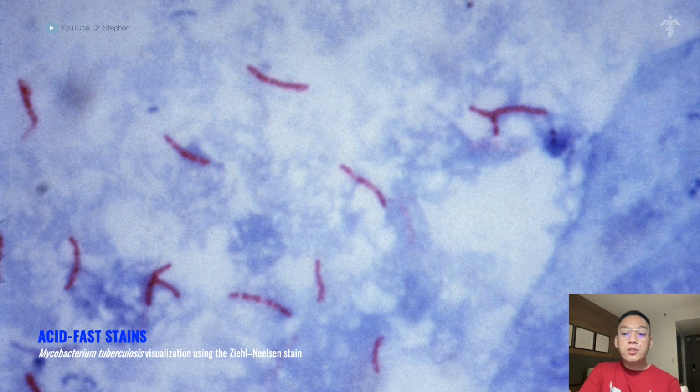Uptake of the carbol fuchsin requires heating the specimen, which we call the hot acid-fast stain. In this technique, called the Ziehl-Neelsen stain, we visualize Mycobacterium tuberculosis.